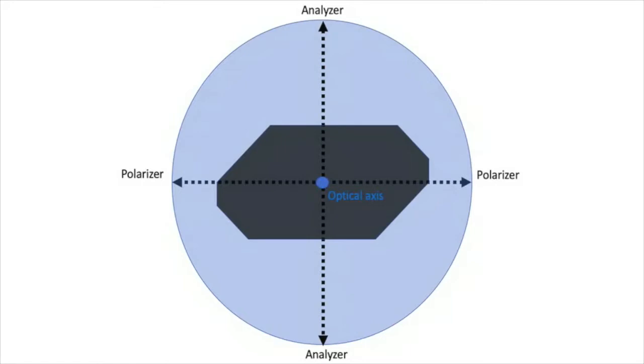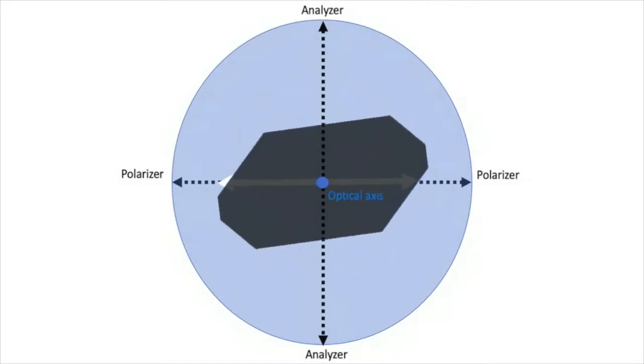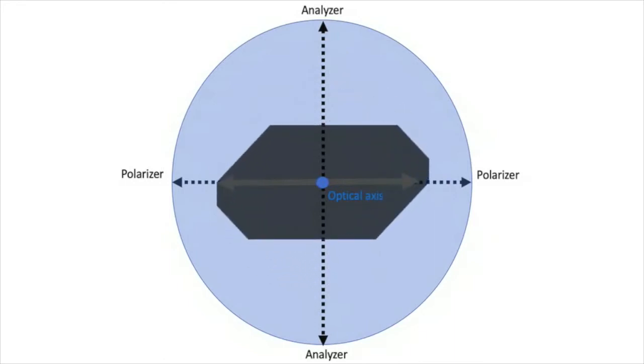In these conditions, the polarized light that passes through the polarizer is blocked by the analyzer and all the V units get extinct, independent of their orientation relative to the polarizer or analyzer. This is characterized as permanently extinct, since the behavior is similar to any other isotropic substance under cross-polars or cross-nicols, independently of how we rotate the stage.